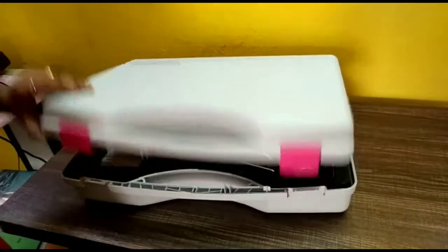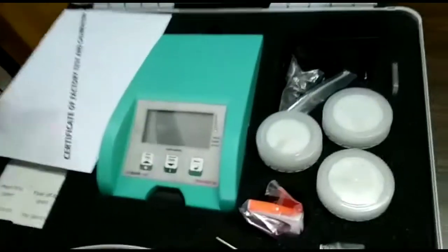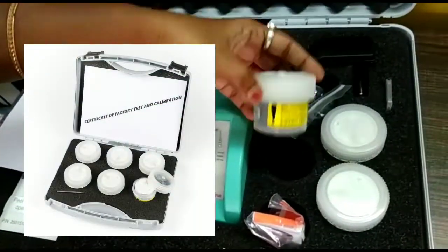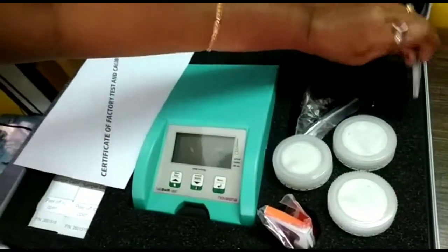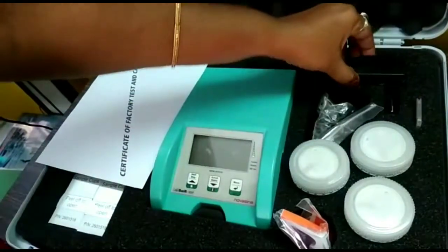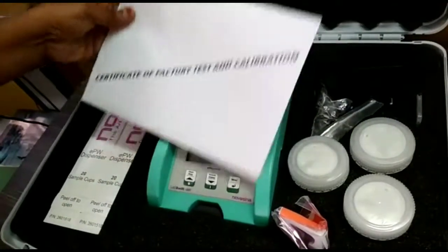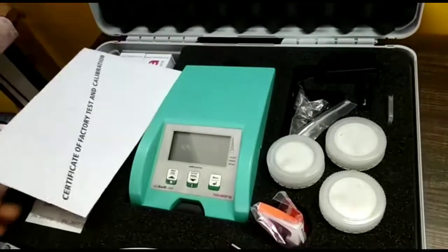Now let's have a quick look inside this handy carrying case. Here we have the measurement instrument in the center, and for testing and calibration we have humidity salts of different salt types, which can also be purchased separately. We have a USB key and SD card for mobile data storage and a power cord. To check all kinds of liquid or solid samples we have 40 sample cups. We also get a certificate of factory test and calibration and a quick guide to get started.